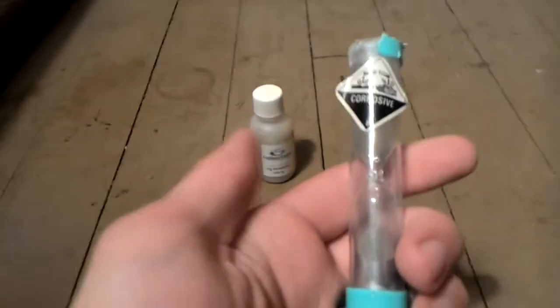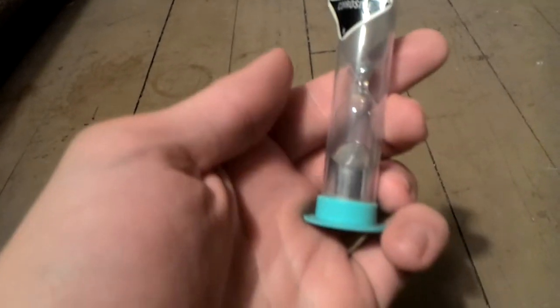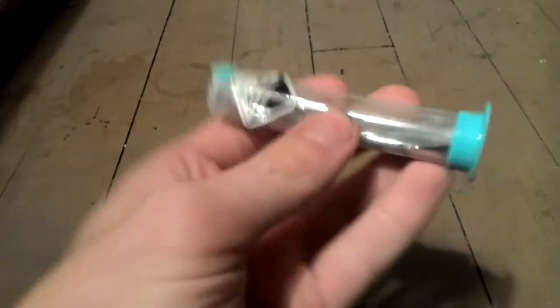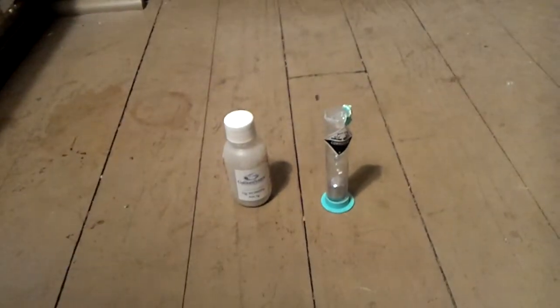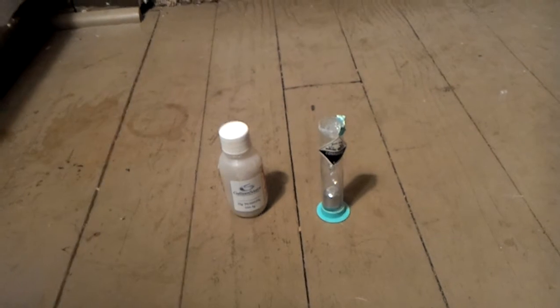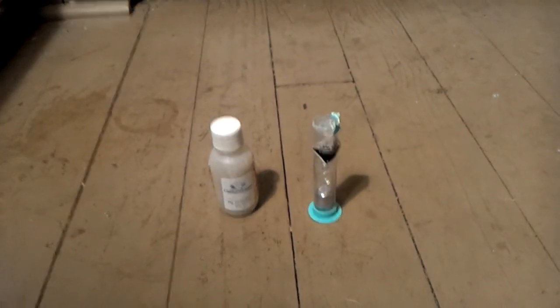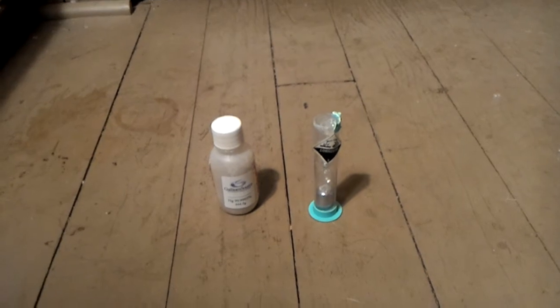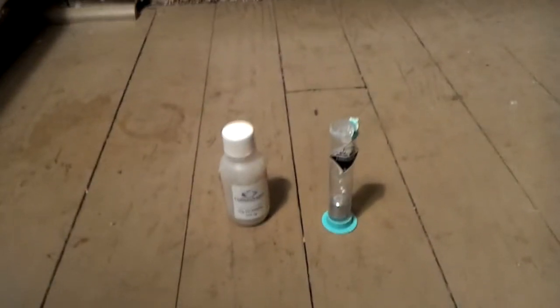And obviously, a big thing with the glass, is that it is dangerous. Like, if you're somebody that's not careful, you could drop it. And it could break, and then you'll have to do a whole mercury cleanup with brooms and things. And that's kind of a big hassle. Have to open up the windows and get a lot of ventilation and things. And you definitely don't want to spill mercury.